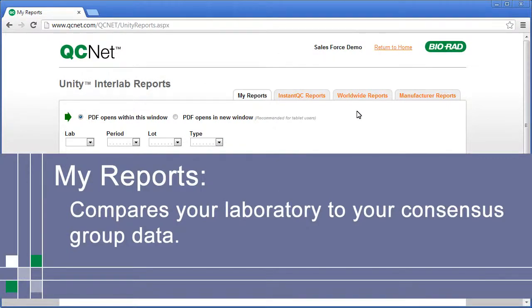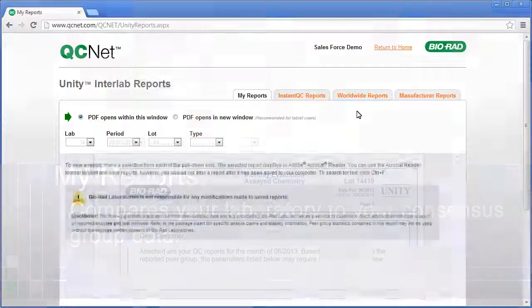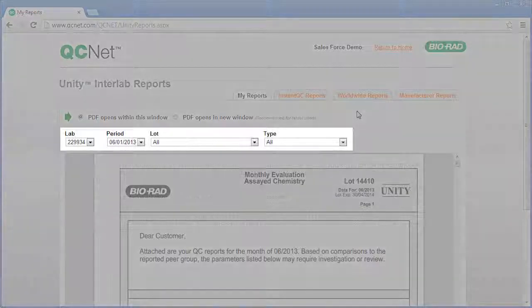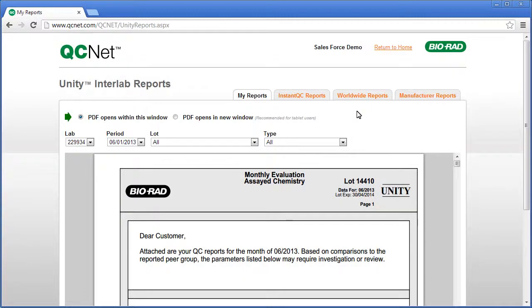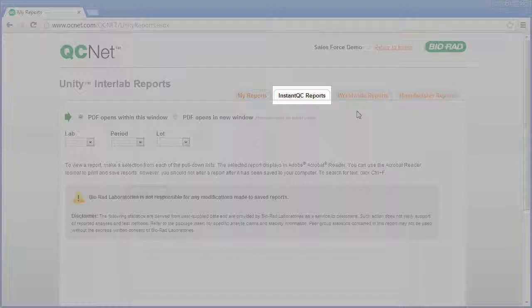There are four different reports. The first is My Reports. This compares your laboratory to your consensus group data. Select the desired parameters and QCNet automatically generates a report.